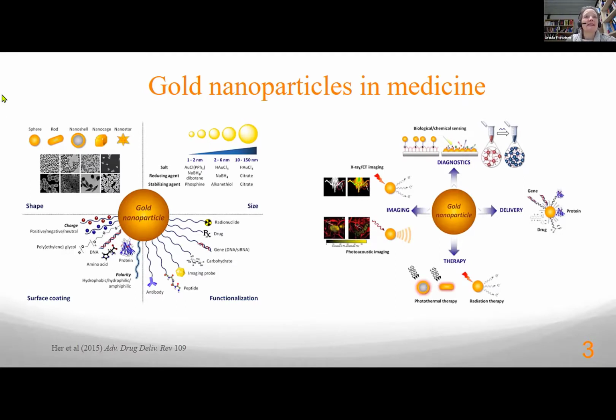Well, thank you. And I see there is another question from Heiko Till, a question from the chat incoming. How do you transfer microtome samples onto your sample carriers? How do you make sure the sample is completely flat on the sample carrier? We transfer them with the pipette, with tweezers. They are not that thin. You can envision them as very thin films, and if you look at them, they're also transparent, but they are not impossible to transfer. It's not a complex problem, and because we spike them with different solutions, they will be flattened by that and fixed to the carrier, and that's also visible if you look back at the electron microscope images. There was a little wrinkle there.